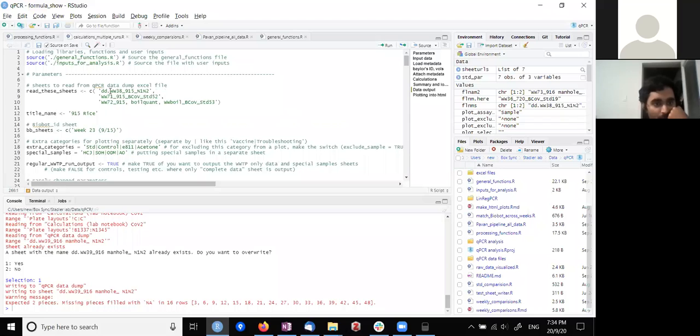So what it's doing is, if all of these are the same samples, it's taking the ddPCR data for that sample and the qPCR for the same sample, it stitches them together, and then it plots them overlapping with each other so you can compare easily.